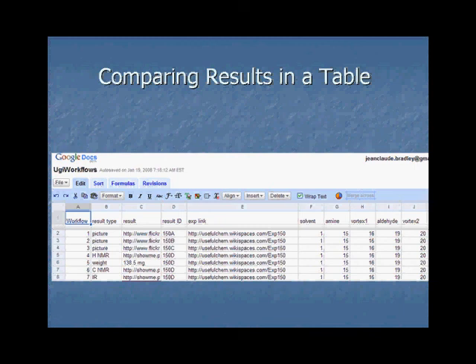Now, if something bad happens at the 12th hour, let's say the student drops the sample, we would call that an aborted experiment, and everything in that experiment probably wouldn't be worth digging through. But if we extract every individual result as something that's addressable and mineable, then it doesn't matter what happens down the road. Somebody who may not be interested in the Ugi reaction whatsoever may just be interested in all the reactions where an amine is reacting with an aldehyde. They would find that here, and they would not get any interpreted information. They would just get a picture of what that looks like: what does this look like if I mix it together and wait 4 hours? So that's a strategy that I've been using to get a lot more information that's much more machine readable and machine crunchable.